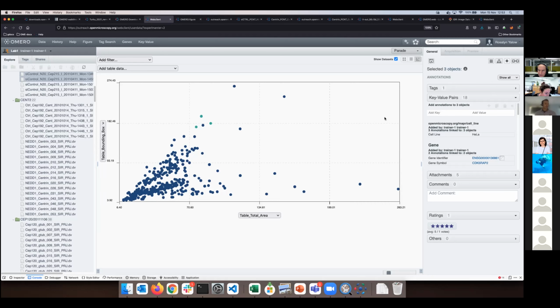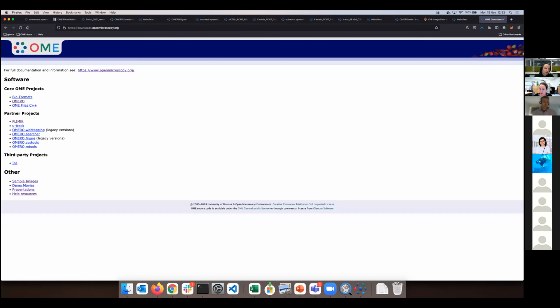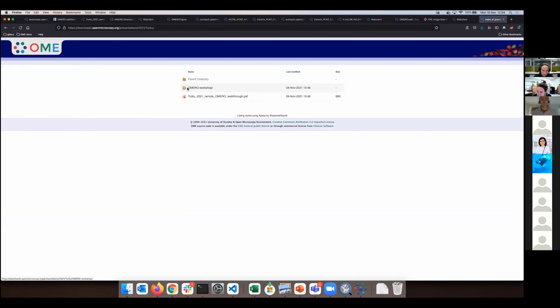Maybe I can ask one question. In the beginning, did you have a shared link, a place where all the materials of today were? There were quite a few links, but I got confused already. Yes, we are going to paste them again. The whole material is hosted on downloads.openmicroscopy.org. Okay, I can click on presentations 2021 Turku. Perfect, exactly. And I will paste that one again. I hope I've pasted it.